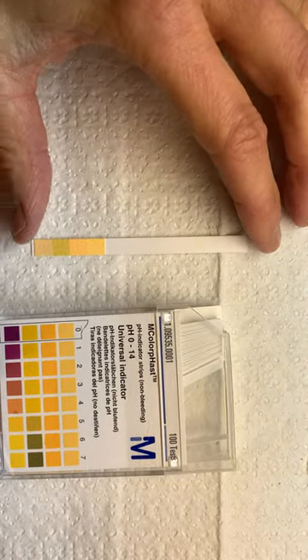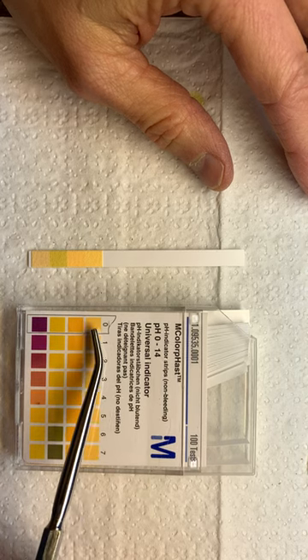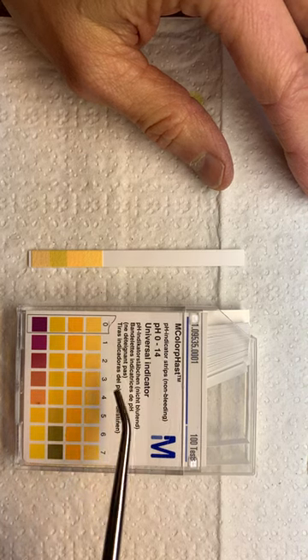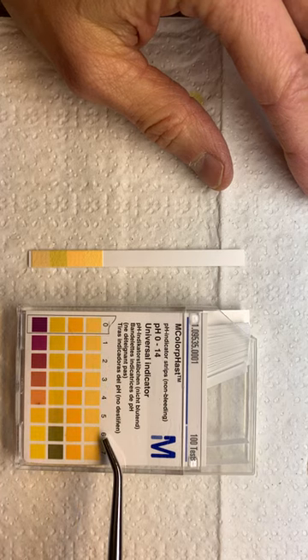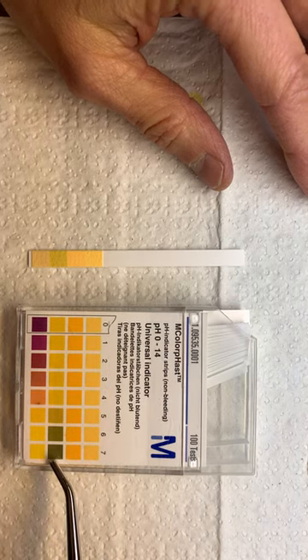You'll compare it by holding it against the box to see where it falls. Here we've got 0 through 7 — 0 through 6 would tell us it's an acid, and then 7 puts us into green here for neutral.